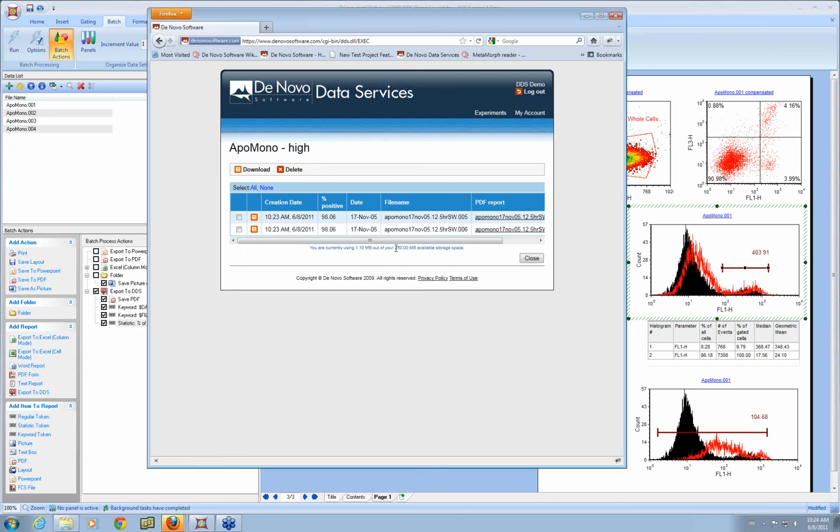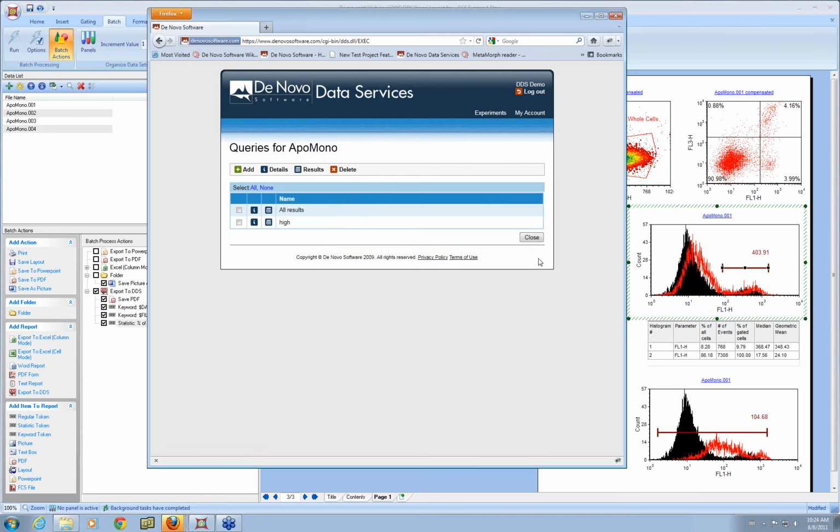So obviously this is a very simple example of doing these queries, but you can use your imagination and see that there's really a lot of different queries you can do to combine to find your results. So after running days, weeks, months worth of experiments, you would have a lot of rows in the results, and you can use these specialized queries to just get details.